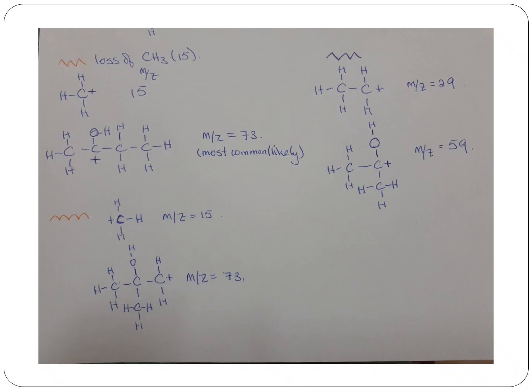Now, I believe that there was an error in this question, so we've not been able to find what 56 is. I may have to get back to you on that. Nevertheless, this here is an example of a past paper and some ways by which fragmentation can occur, and I hope you have a better understanding of how you can approach your fragmentation to determine particular fragments when given a question.